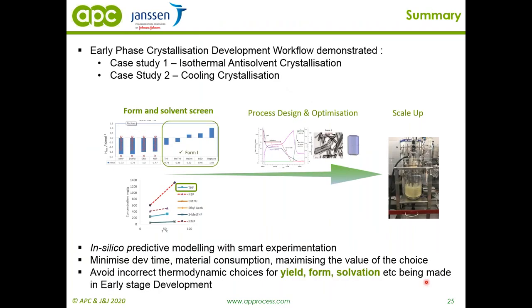So with this, I would like to summarize what I presented. I hope you were enjoying the presentation, and I hope I managed to demonstrate our workflows for early phase crystallization development. So I presented one case study with isothermal antisolvent crystallization and the other one with cooling crystallization. And I hope you got interested in the methodology which we are using for solvent selection. So we are based on in silico predictive modeling, followed by smart experimentation. And for smart experimentation, we are using parallel reactors, so Crystal16, Crystalline. And I also hope I managed to demonstrate that Raman is quite useful for solvent and impurity identification, as well as the form.